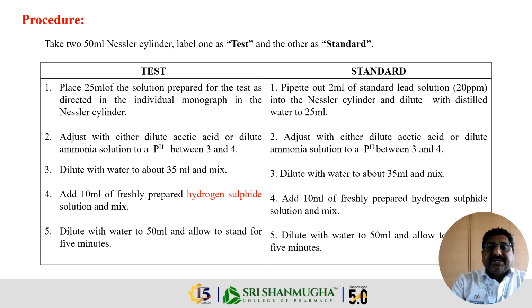After adjusting the pH, the required reagent is added to both cylinders. Both solutions are then diluted to the mark and mixed properly. After standing for 5 minutes, the color developed in both the cylinders is compared.